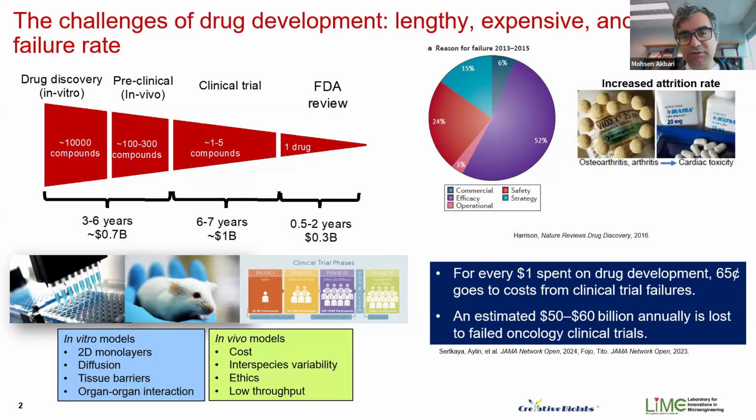And we think, I think my team, and then I believe Creative Biolabs team as well, we think that the challenge is in the models that are being used for developing the drugs, specifically the traditional in vitro models, which are basically 2D monolayers of cells being grown on flat surfaces, which are mostly plastic surfaces, perhaps coated with proteins, but still the cells experience the hard surface, which is not similar to what cells typically experience in the body in most organs.